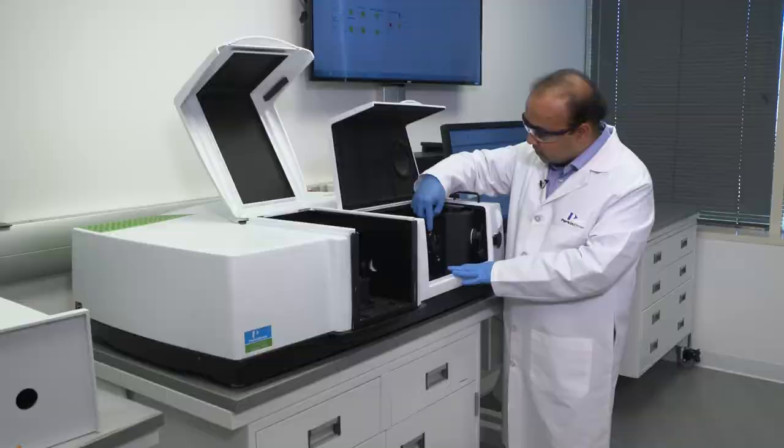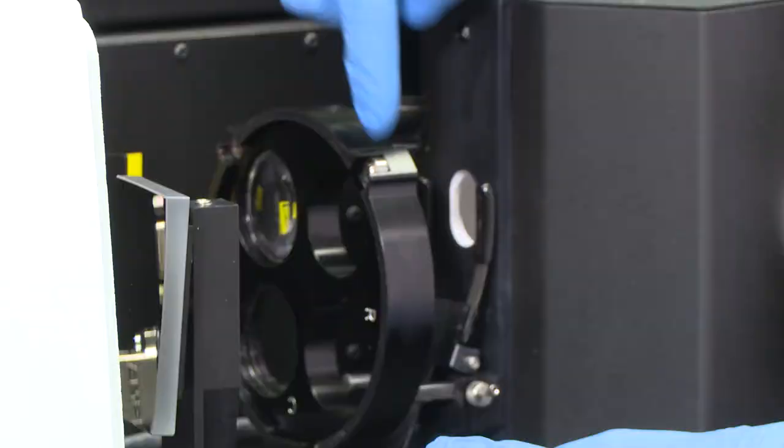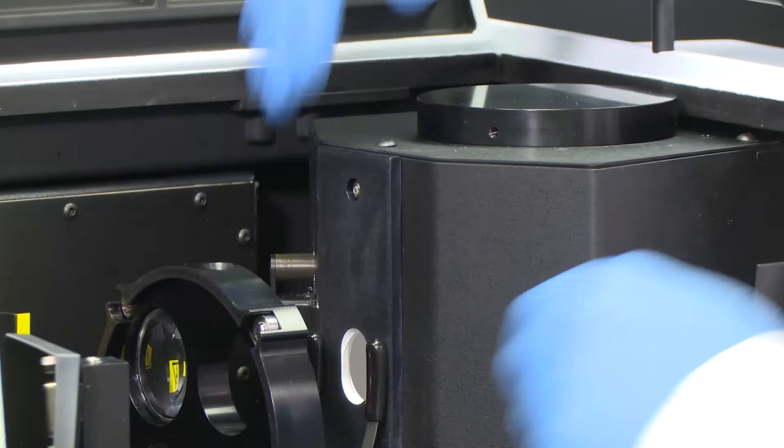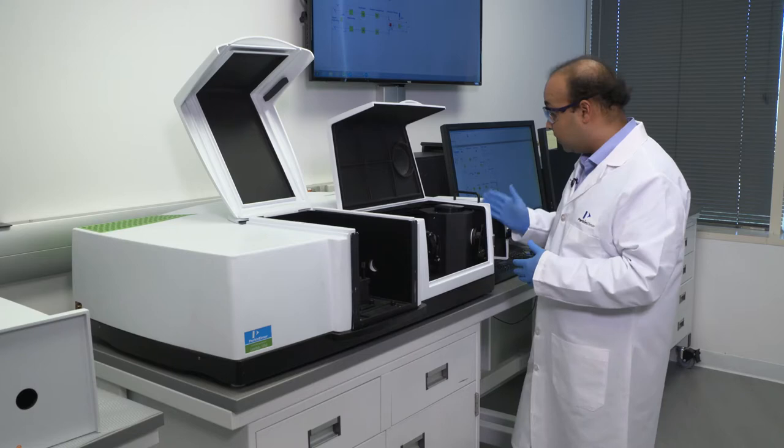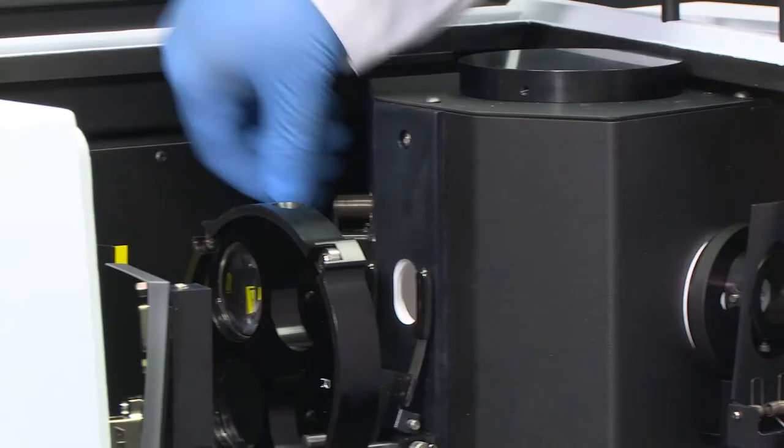Now coming to the integrating sphere here, this is an accessory shown here of the small spot kit that is capable of making very small measurements or very small spot sizes. The integrating sphere itself consists of a transmittance port over here and at the back there's a reflectance port. So we can use these to measure transmittance of the sample or have a sample at the back port and measure total reflectance.